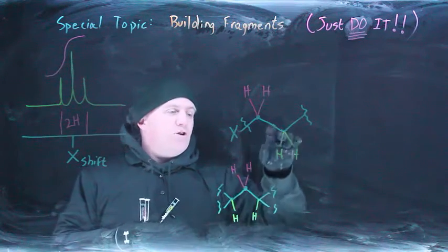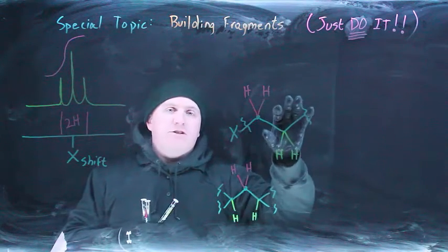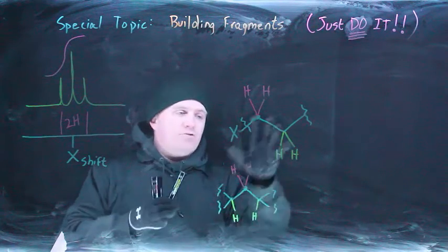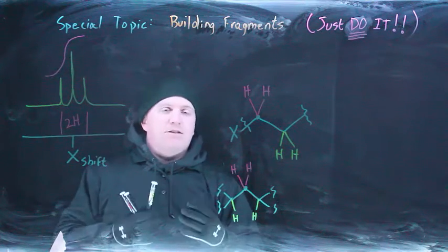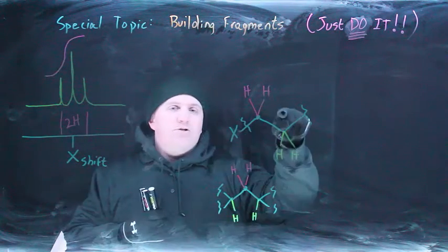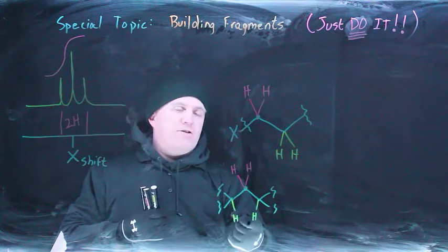But even if you draw this and then later regret it, you can go back there. As long as you start drawing out these fragments, you're drawing the assumptions you've made. And so if you cannot make the system work after drawing a bunch of fragments and figuring out, okay, this really doesn't fit together and it doesn't make sense and so on, then you have the capacity to go back and change some assumptions. So what I would do, faced with the peak in the first case, is draw this first. And if it turns out that it doesn't work, no matter how hard I can make it work, then I might start thinking about this instead.